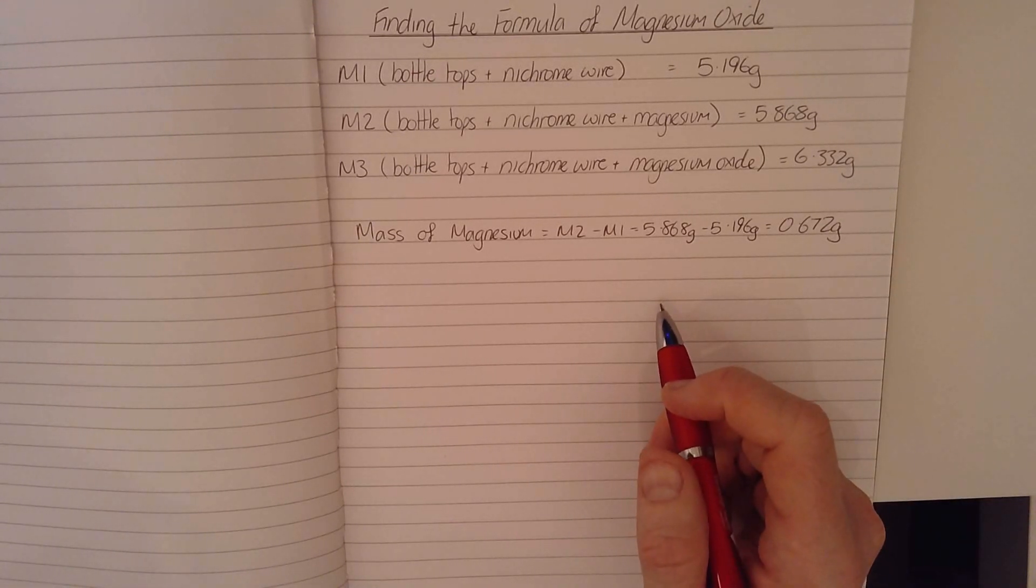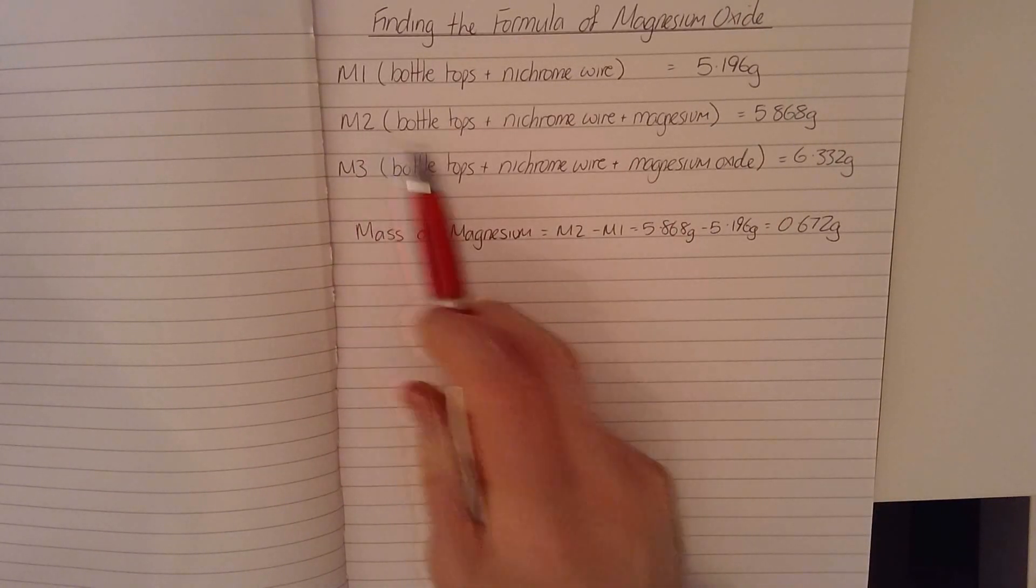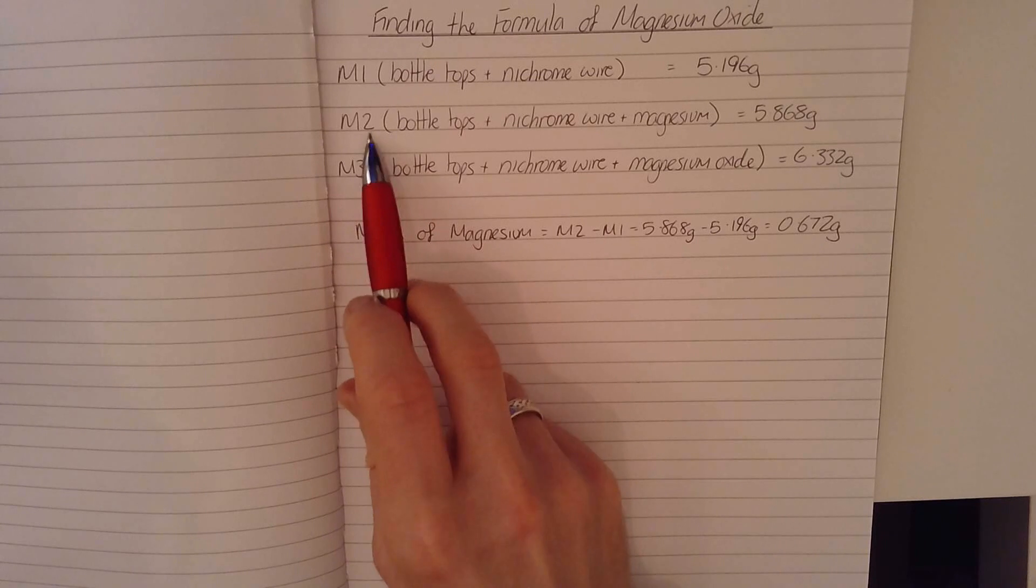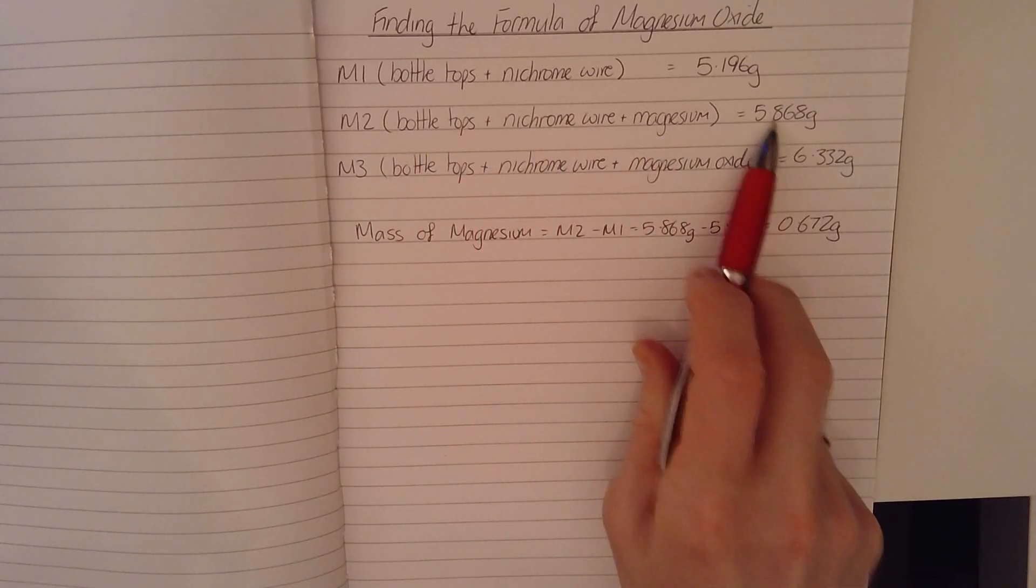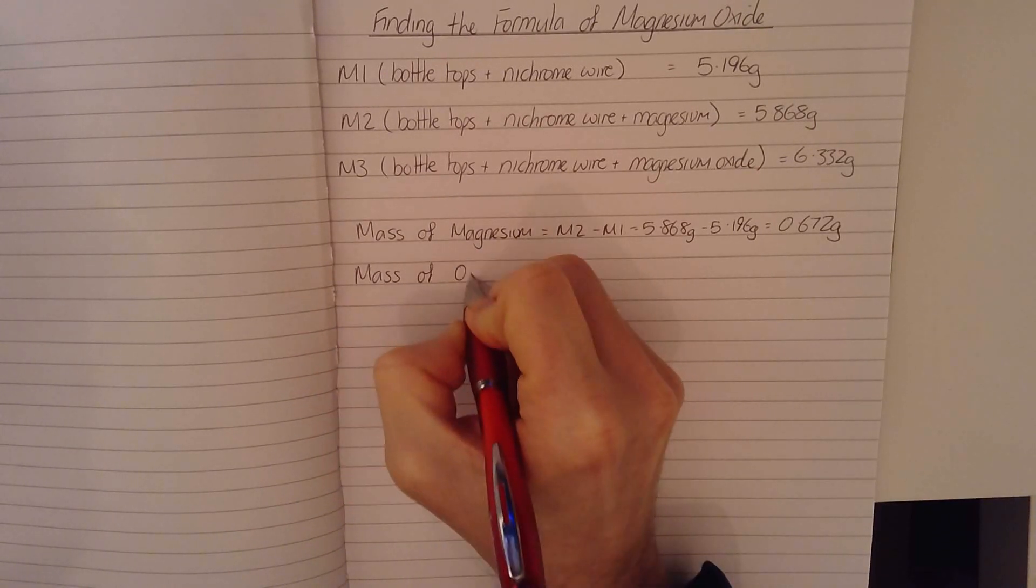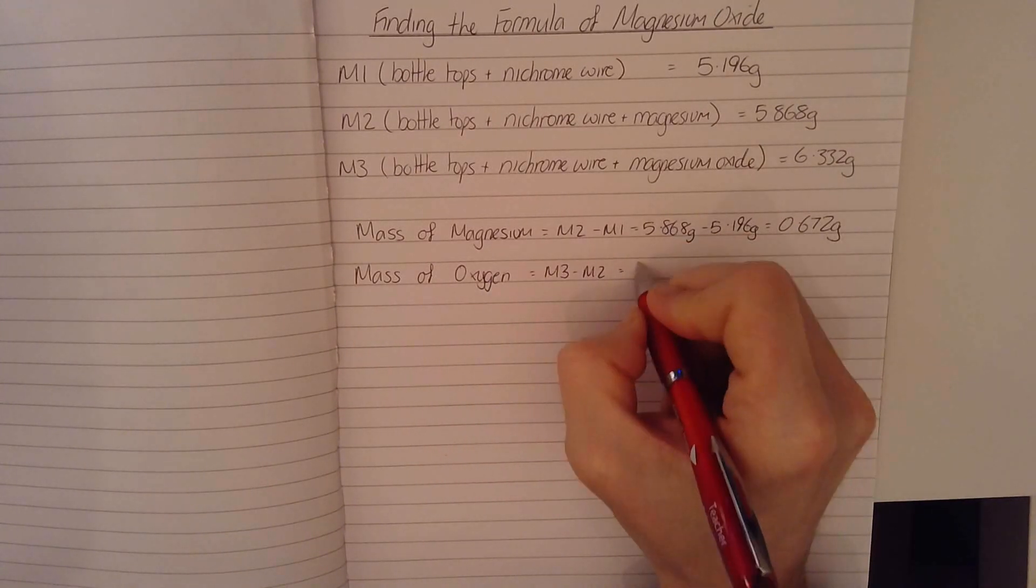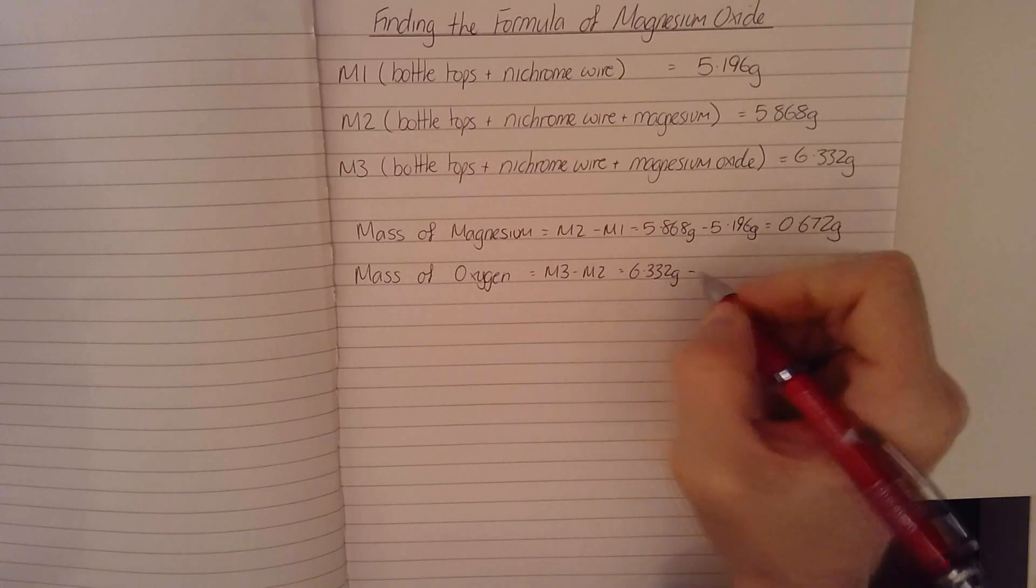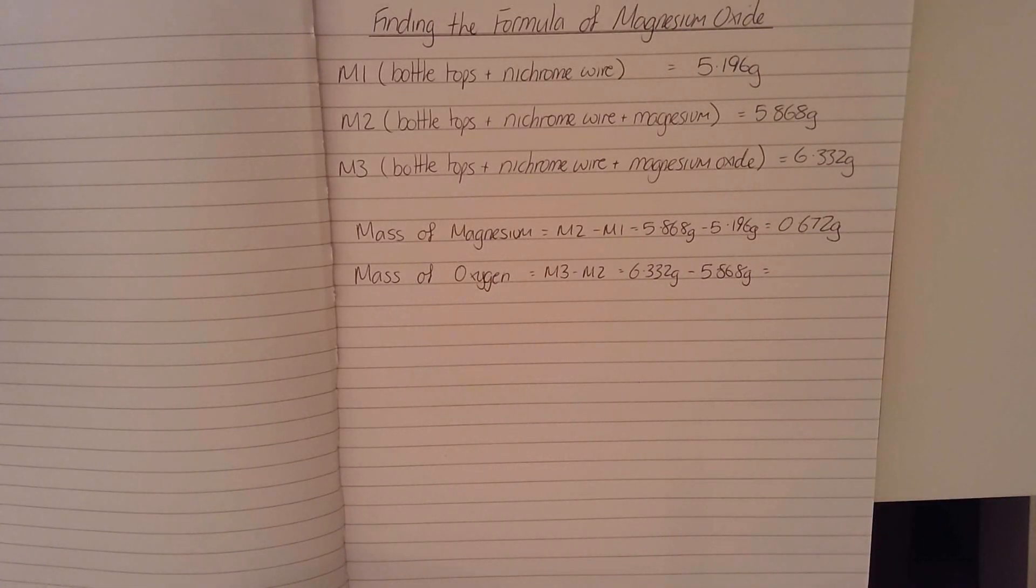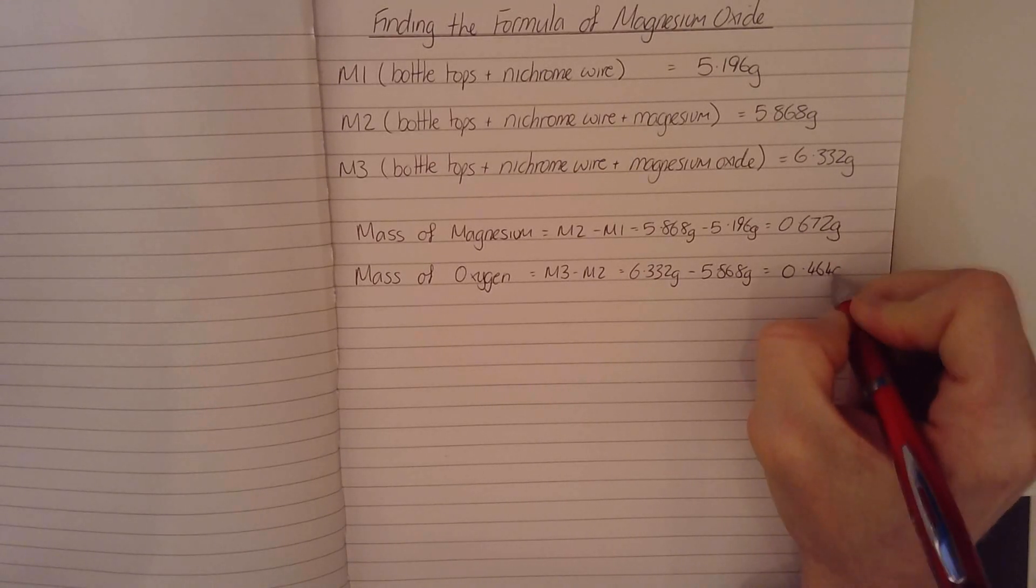Now I can work out the mass of oxygen that has bonded onto my magnesium by taking M3 and subtracting M2. Because M3 was the bottle tops plus the wire plus the magnesium oxide compound, and M2 was the bottle tops and the nichrome wire and just the magnesium. So this difference in mass here is from the oxygen. So the mass of oxygen is equal to M3 minus M2 equals 6.332 grams minus 5.868 grams. And that comes to 0.464 grams.